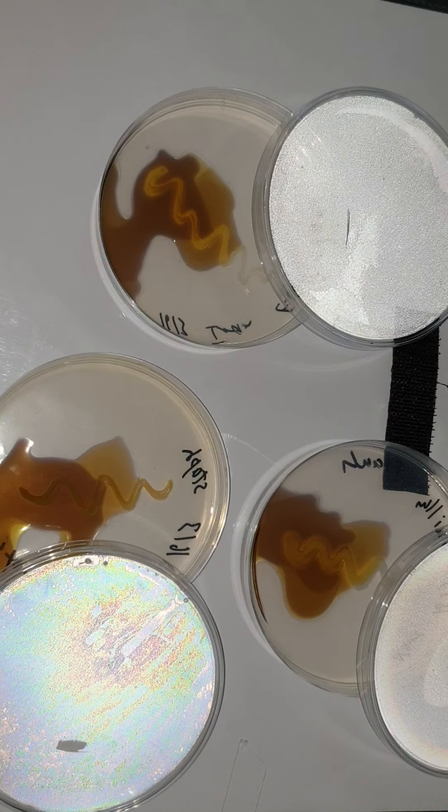In the case of Staphylococcus, no matter how close I get to the petri dish, if you follow the area — regardless of the fact that the colony itself is orange, which does not indicate anything — look at the area around the colony: there is no hydrolysis zone. It's all dark blue, indicating the presence of starch, and therefore the bacteria was incapable of producing amylase. So E. coli was incapable of producing amylase, Bacillus was capable — look at the highlighted zone around the colonies — and Staphylococcus was incapable.